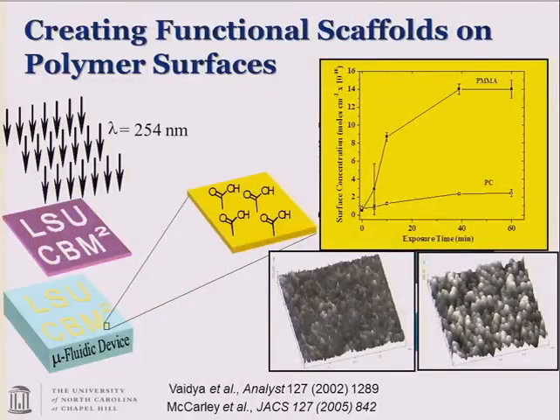All right, so we have to attach things to this polymer surface. What we're trying to do, let me back up and say one more point too. When you make these chips for diagnostic applications, and I said this morning, typically you're not doing this for research, you're using it for one sample and you're discarding it. So you'd like to keep the chip cost low.